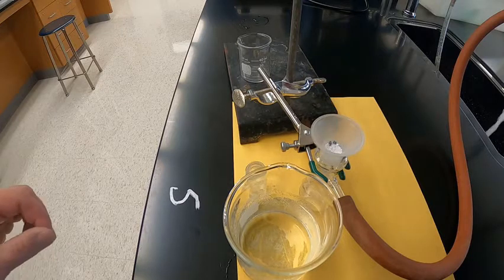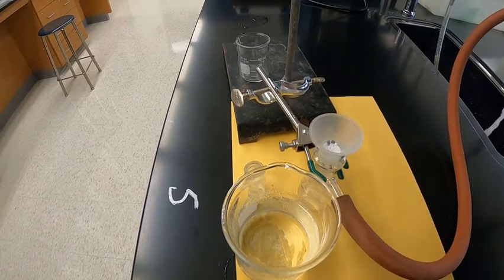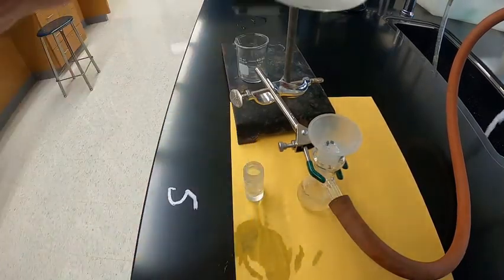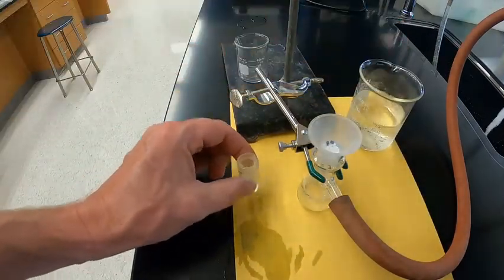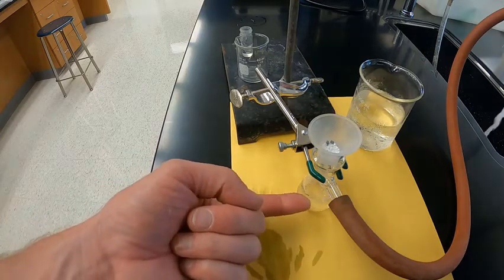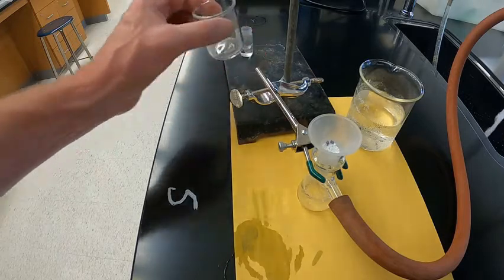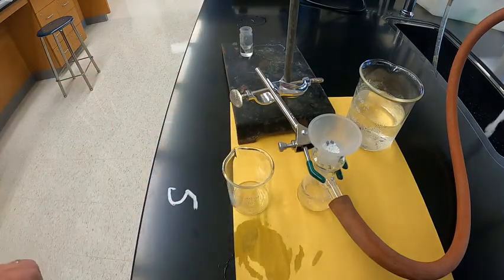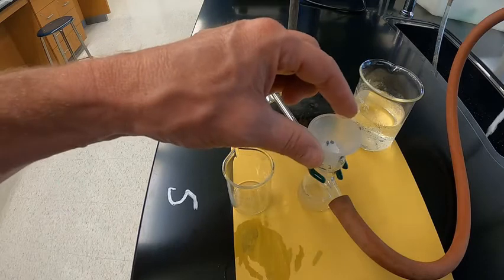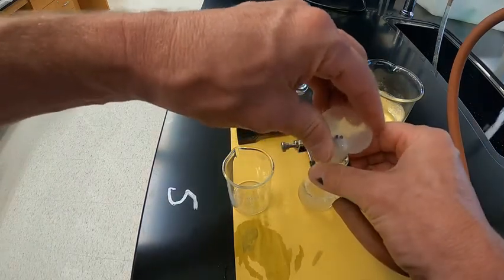Alright, so I'm going to assume this is dry enough. So when you use a Buechner funnel, it's under vacuum, and what that means is any liquid down here is also under vacuum. And what tends to be a better approach for getting your sample out of the funnel before you turn the water off would be to loosen the funnel.